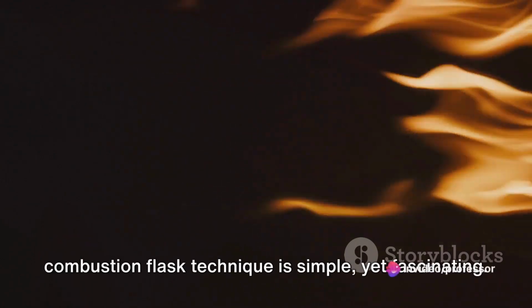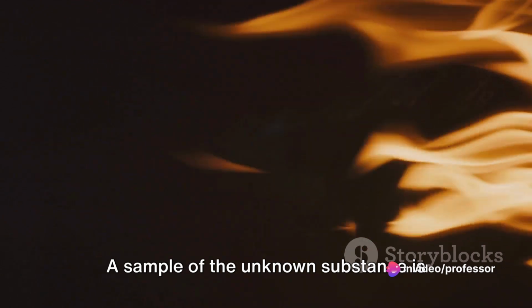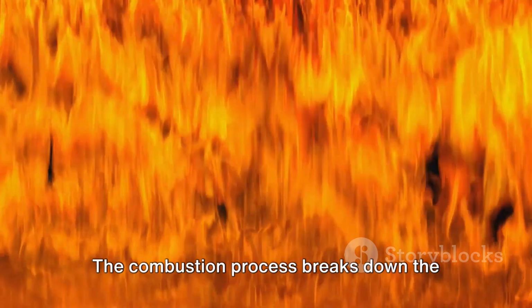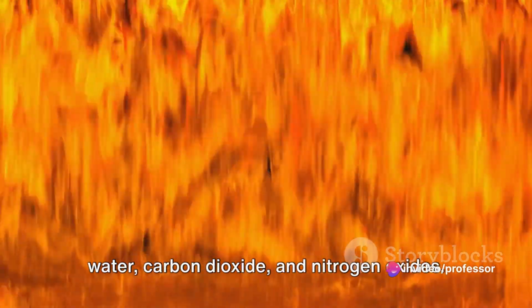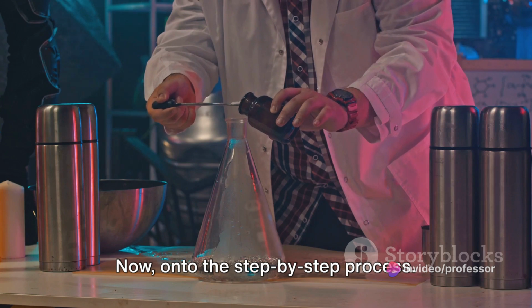The principle behind the oxygen combustion flask technique is simple, yet fascinating. A sample of the unknown substance is burned in the presence of excess oxygen inside a combustion flask. The combustion process breaks down the substance into its elemental components, which then react with the oxygen to form water, carbon dioxide, and nitrogen oxides. Now onto the step-by-step process.